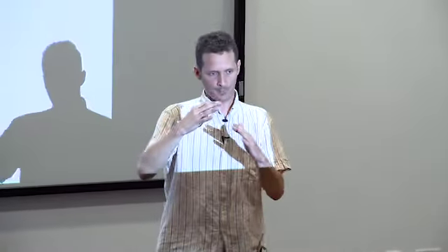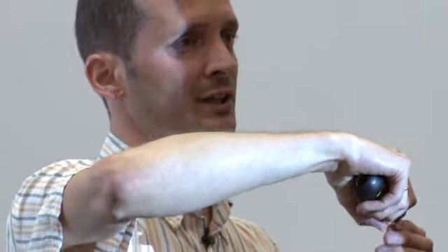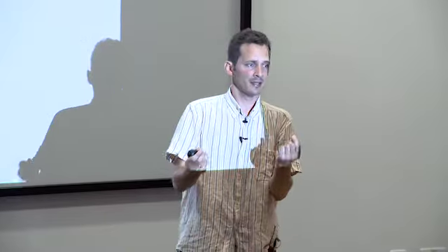It calculates the three-dimensional reconstruction as we're going to sum, in the 3D Fourier transform space, all these two-dimensional Fourier transforms of all the images. We're going to calculate these probability-weighted assignments over all their angles, so every image goes in with all the angles. And we're going to measure how much noise there is in each of those individual images, and measure how strong the signal is in the actual reconstruction that we make out of that. Using that information, we then get a full description of the three-dimensional signal-to-noise ratio in this Fourier space.